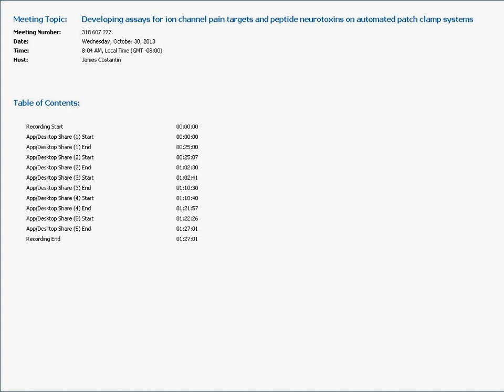So, thanks, Tim, for the intro. Pretty much I'll just be talking about a validation of different derivatives of a gastropod toxin, 6-bromo-2-mercaptotryptamine, or I'll just call this BRMT for short. What I'll show you this morning is data on the efficacy of these different derivatives using the IonWorks system. All this data was obtained using an ensemble setup from the IonWorks system with the 384-well plate.